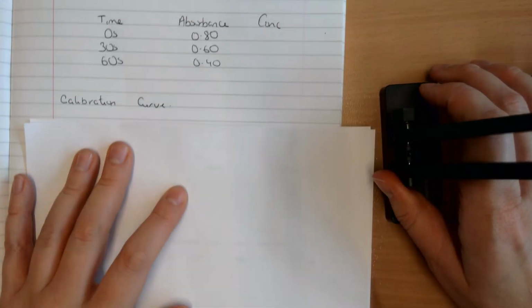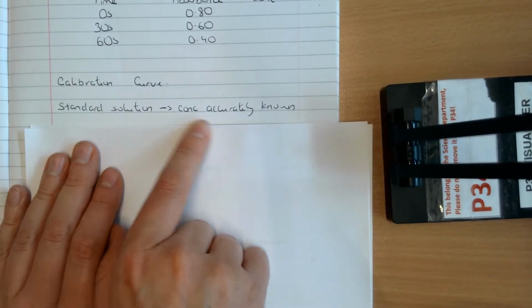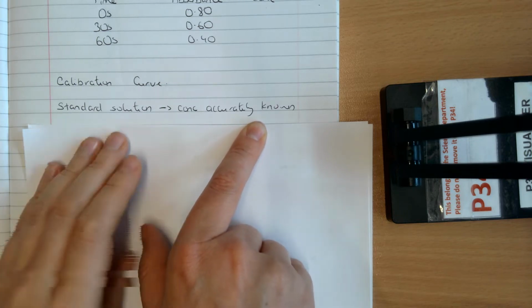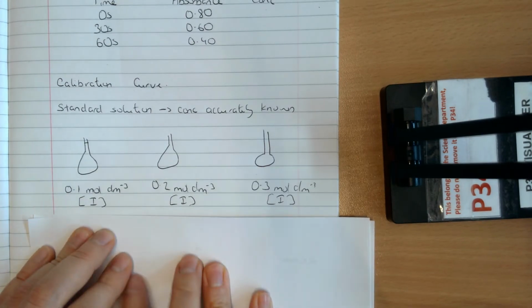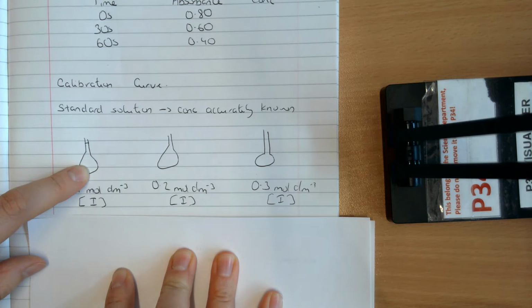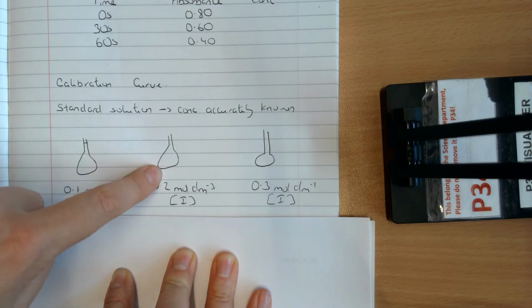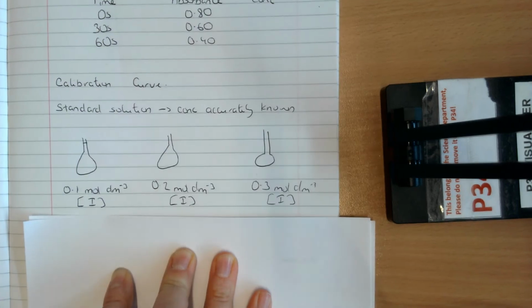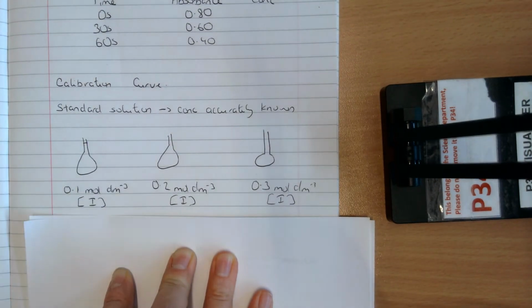So to plot a calibration curve, I'm going to need to make up standard solutions. And standard solutions are just solutions where the concentration is accurately known. And the reason that the concentration is accurately known is because you're going to make those solutions yourself. So if I want to make up a standard solution, I'm going to use a volumetric flask. And in one volumetric flask, I might make up a concentration of iodine of 0.1 moles per decimetre cubed. And in another flask, I'll make up a solution with a concentration of 0.2. And in another flask, I'll make up a concentration of 0.3. And so on. I know exactly what the concentration is because I've made those solutions myself.